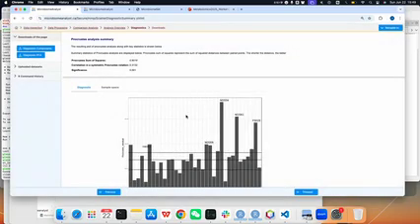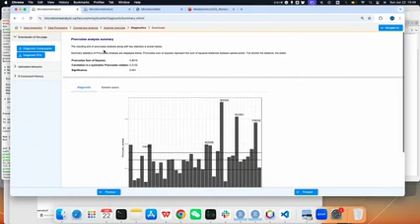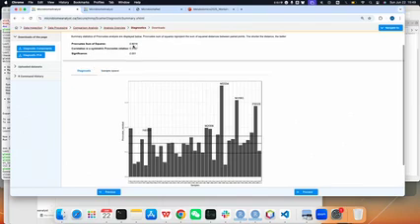Firstly, we use the Procrustes analysis. Yeah, this is the Procrustes. Here we get the diagnostic statistics and figures. It's clear to see we got the sum of squares.